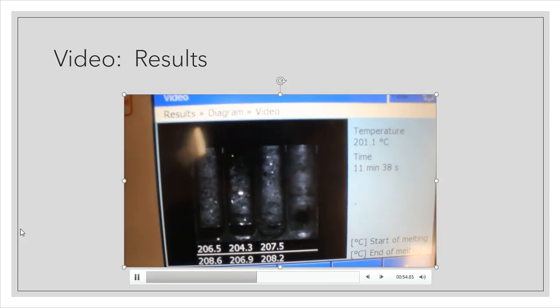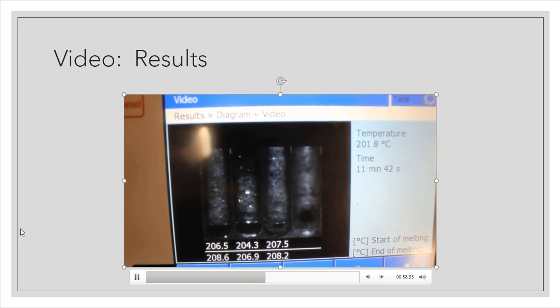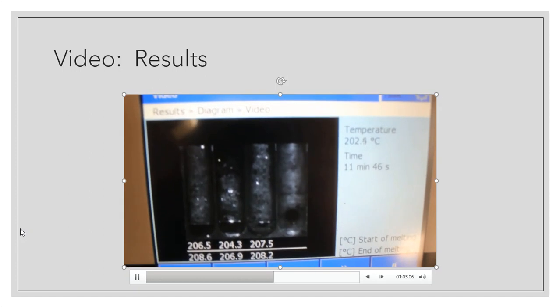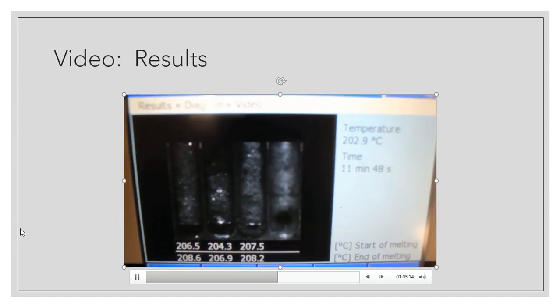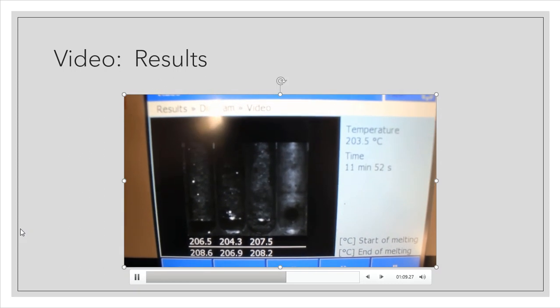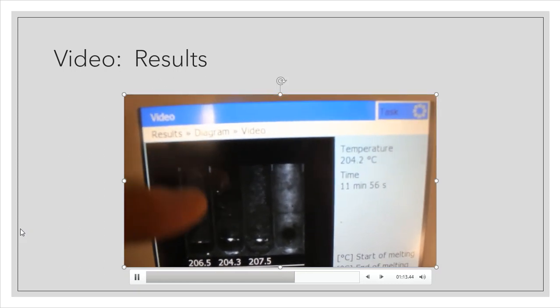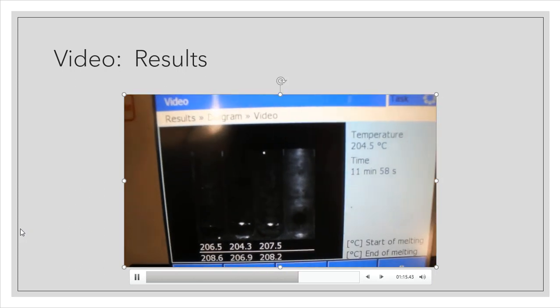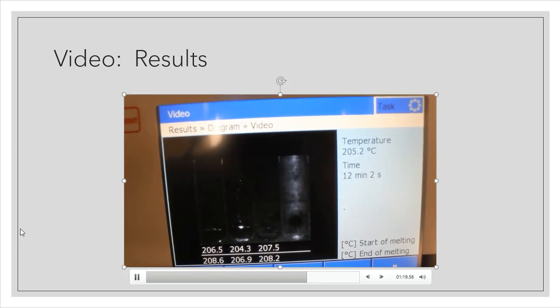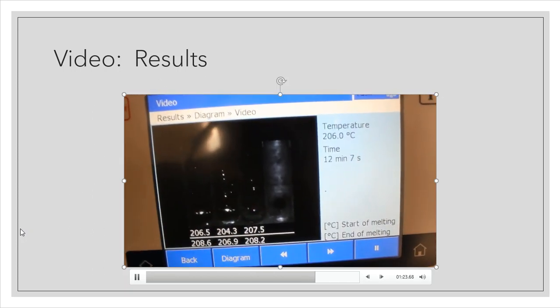to change. So as we wait patiently, like waiting at the doctor's office, we now see a little bit of flicker in the crystals. When we do that, we see some movement. This is at 203. And around 204, look at this. I really don't see visually any solid crystal that's left over. 204.5, 204.9. Now the question is always, why does the instrument give me these values down here?